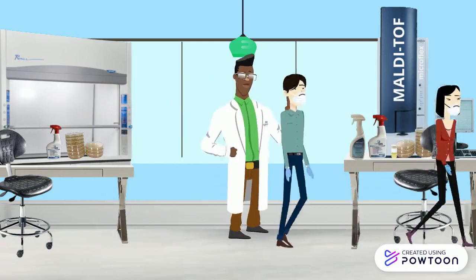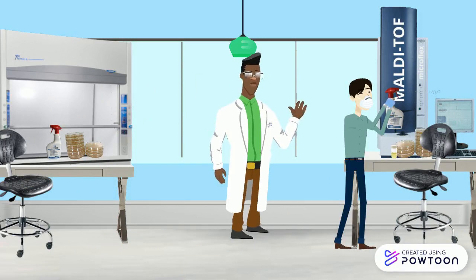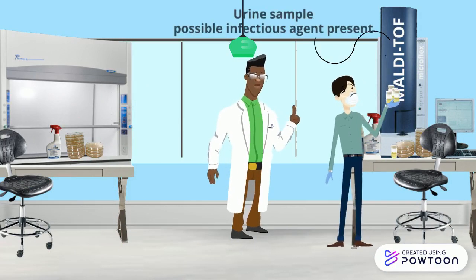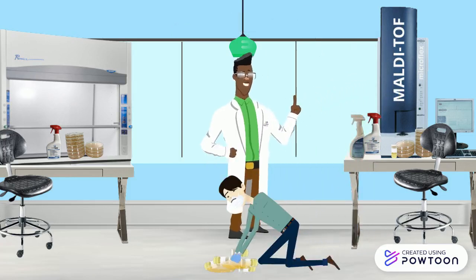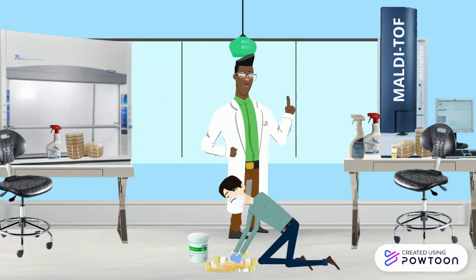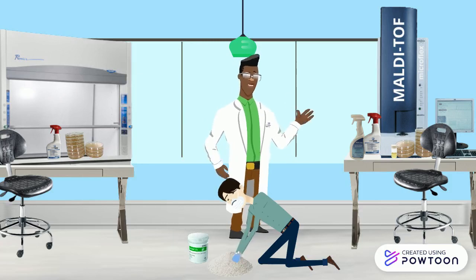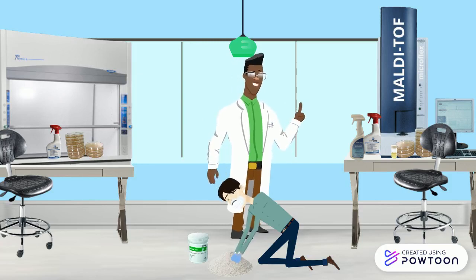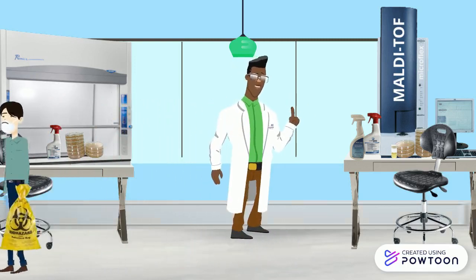Cleaning and disinfection of benchtops, analyzers and computer equipment are done by lab staff. This is to reduce the risk of infection and contamination. The decontamination of biological spills such as blood or other bodily fluids can also be performed using the Actichlor Plus. This is used to cover the area of spill or debris. You would leave it on the spill for 2 minutes and remove using paper towels. All waste from this would go in a yellow lid biohazard bin or bag.